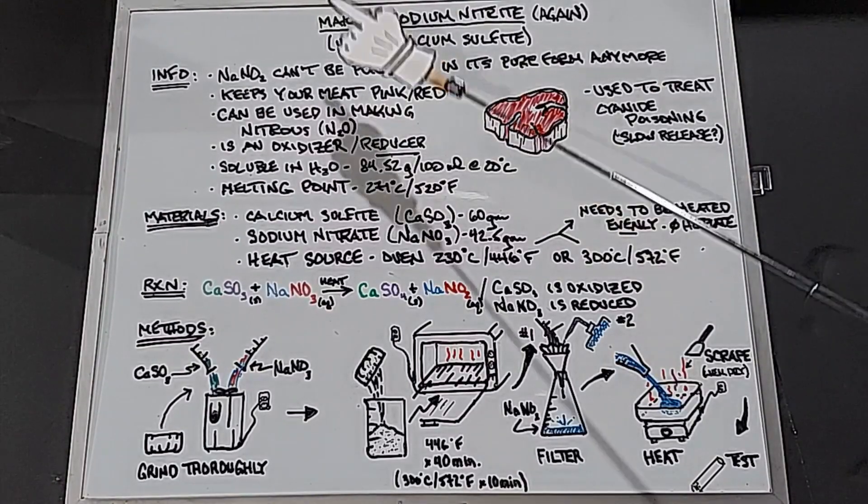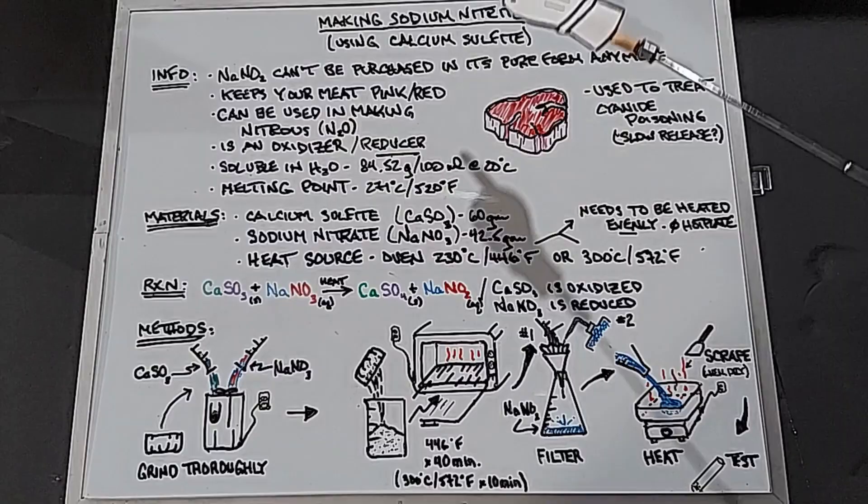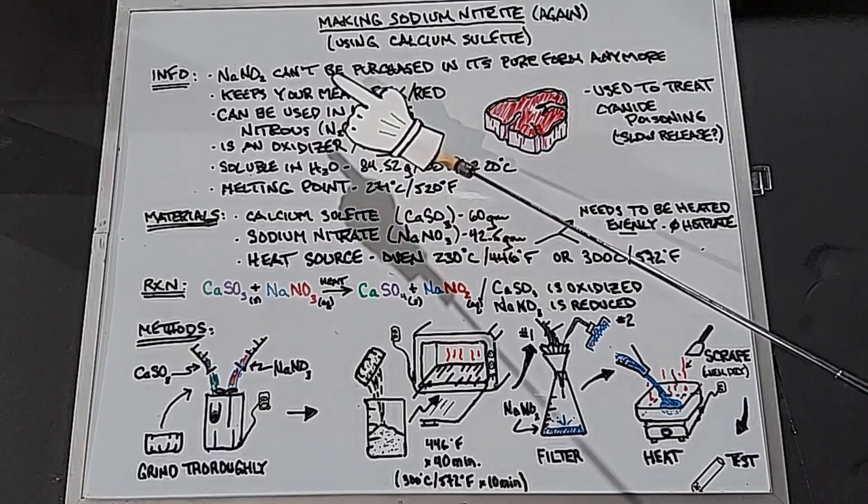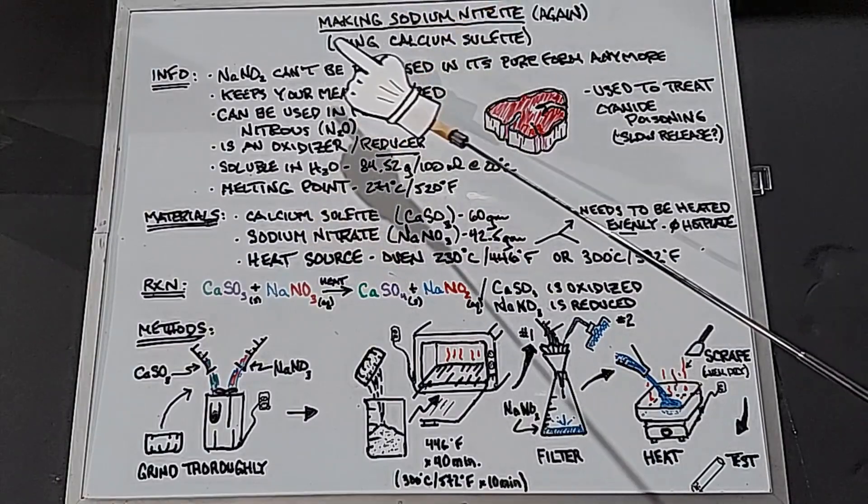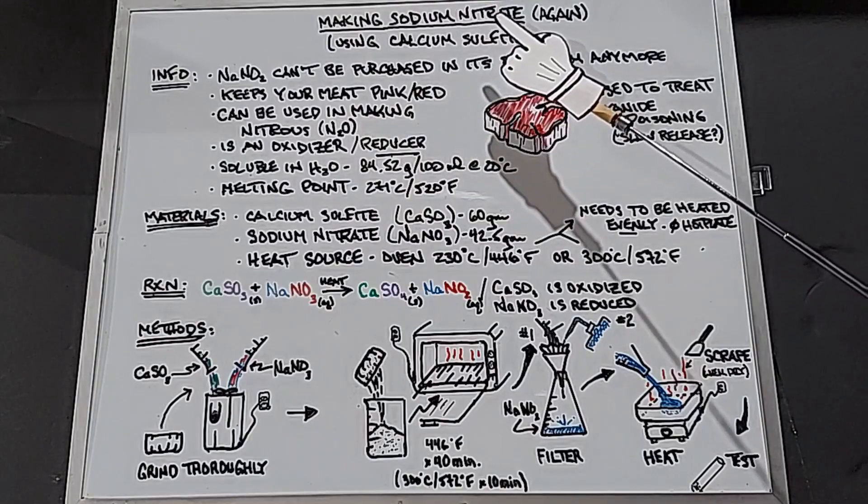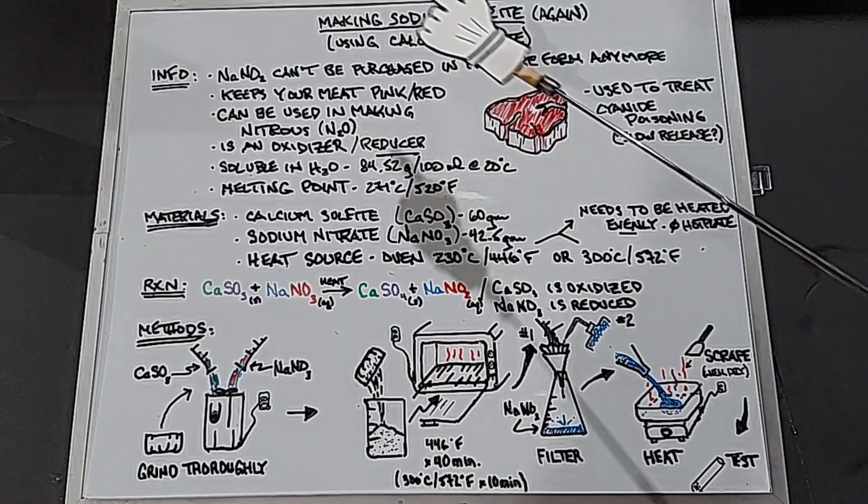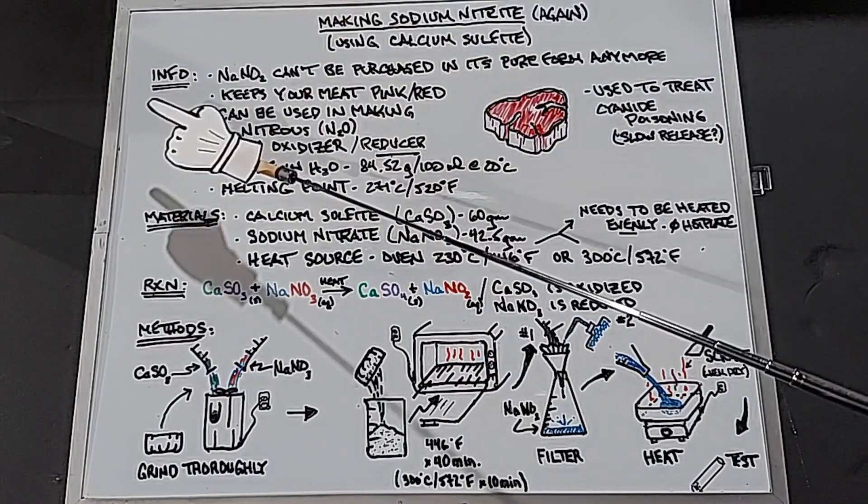In this video, we're going to look at making sodium nitrite. Again, I've done a couple of videos already on making it, not using this process, because this time we're going to use calcium sulfite, which was made in a previous video. Since I've covered this before, I'm going to go through this quickly.